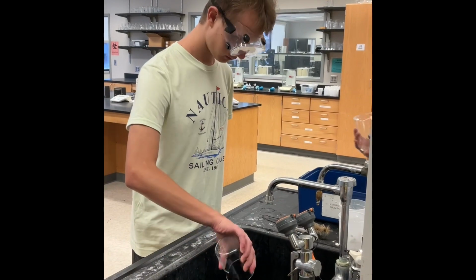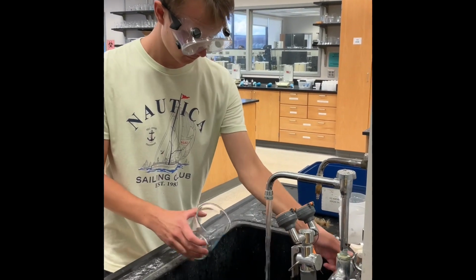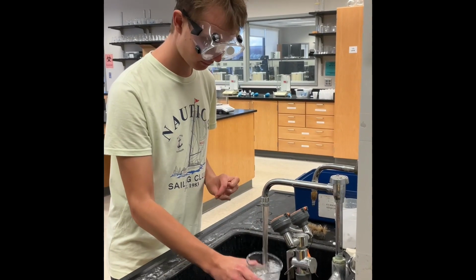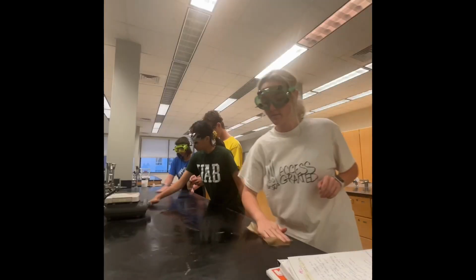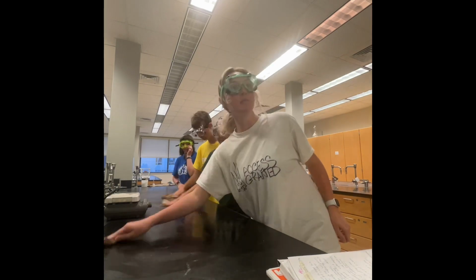After that, we cleaned, dried, and put away materials in their proper areas. We then followed up with wiping down the lab experiment area with paper towels and water. Note that this is not how one cleans up every single lab experiment, so follow up with your lab proctor for proper cleaning instructions. Lastly, remember to keep your goggles on until you leave the lab room and the experiment is over.